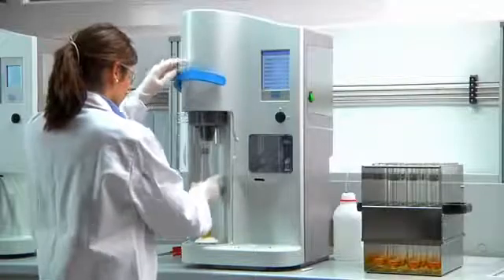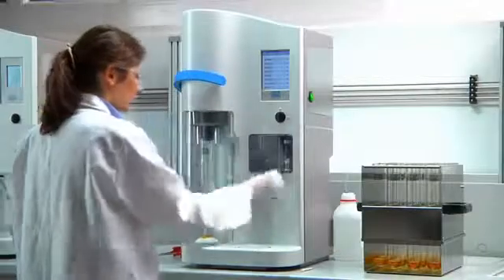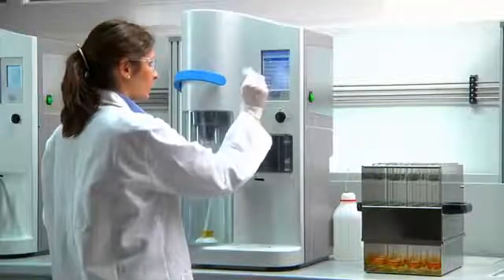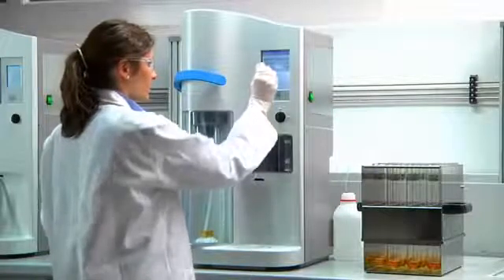A comfortable lever lowers the support so that they can be introduced and clamped into position. A transparent door allows visibility of distillation while providing user protection.